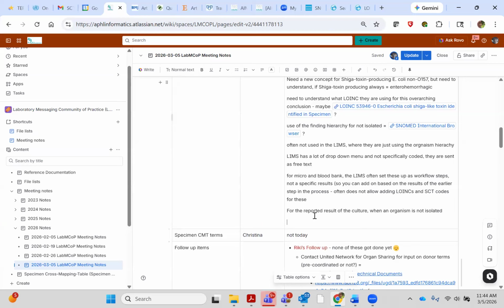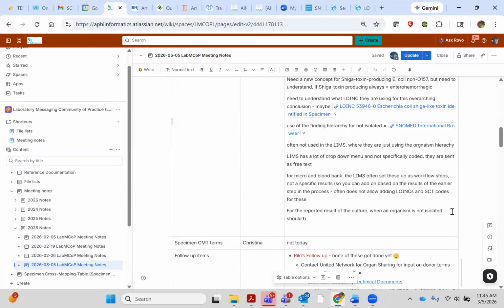So the scenario I'm looking at is for CLSI, labs have to report some organisms where they have the susceptibility numeric result, how many millimeters, in OBX5, and then the interpretation goes in 8, whether it's sensitive, resistant. In other cases, there are some organisms they can just report out if it's sensitive or resistant, and they don't put in the numeric, so it's just the qualifier value, and then they can map it to SNOMED qualifier values, which is great.